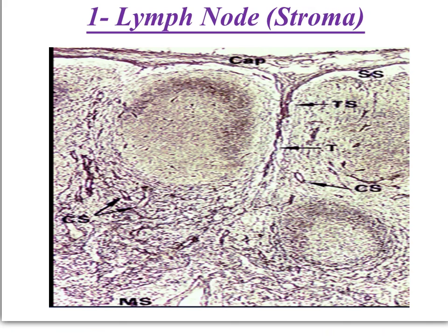This picture demonstrates the stroma of the lymph node. The lymph node is formed of stroma and parenchyma. The stroma is formed of the capsule here and a number of trabeculae arising from the undersurface of the capsule, and a background formed of reticular connective tissue, which is formed of reticular cells and reticular fibers. And in the holes of this background, the cells of the parenchyma are present.